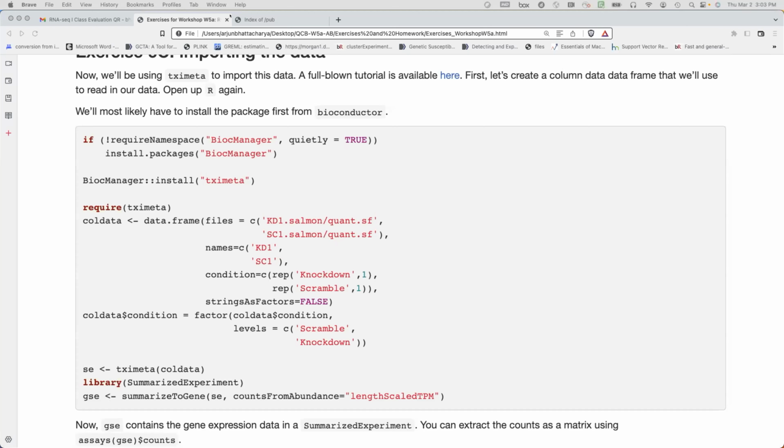Okay. Everyone else? Anyone else having trouble running the quantification step? No, I'm still in trouble, but I don't want to keep you. Oh no, we have lots of time left. Is it still going, or is there an error? It's just still around 50%. Okay, all right, that's fine. Anyone having errors? Did we have to load fastq?